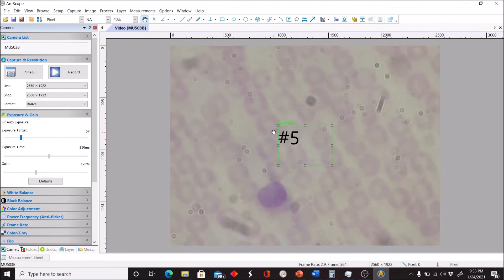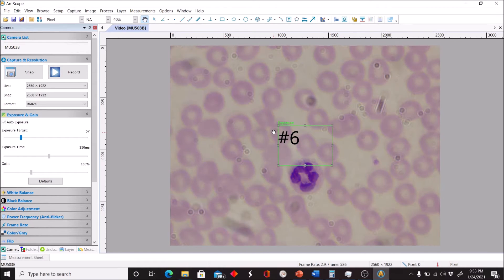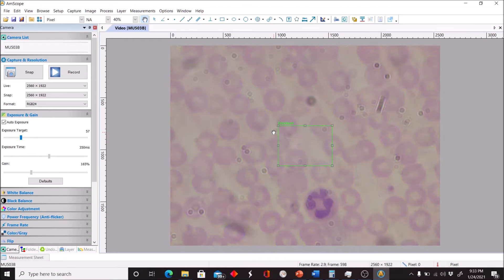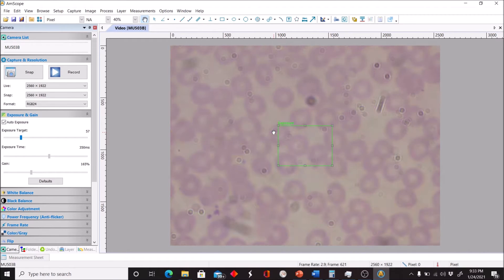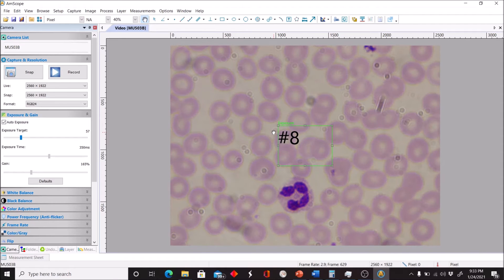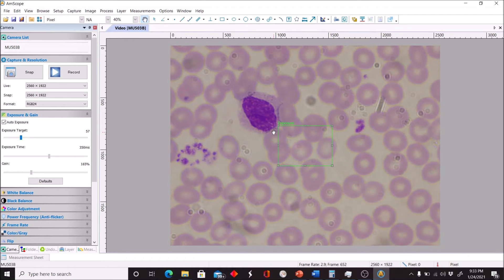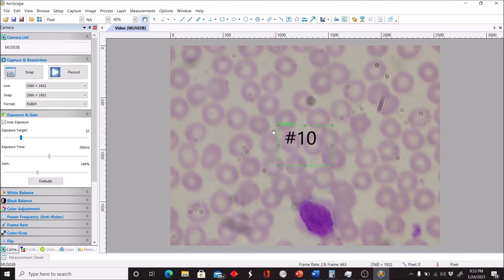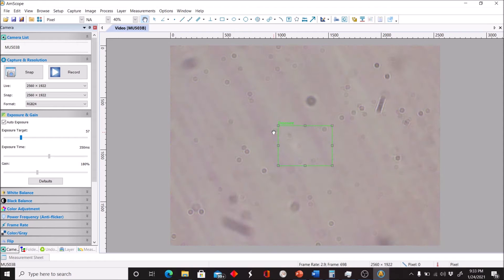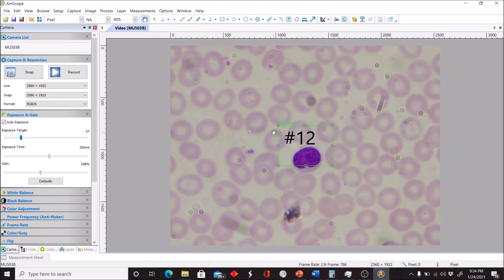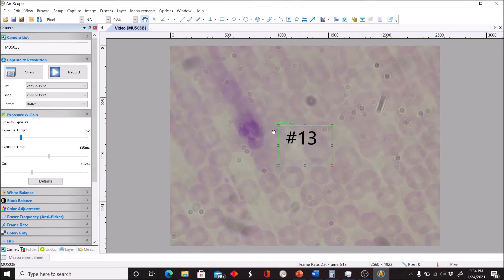We have two cells here — try to identify them. Do your best to identify each cell as we go through. Look at the size and the staining properties of each one. Take your time with each cell shown on screen.